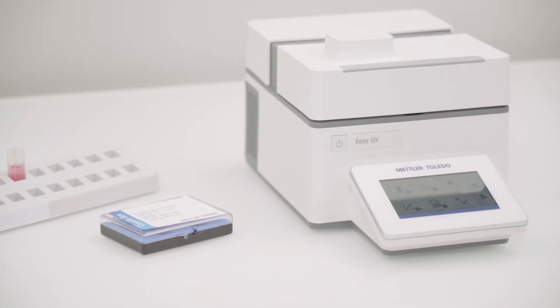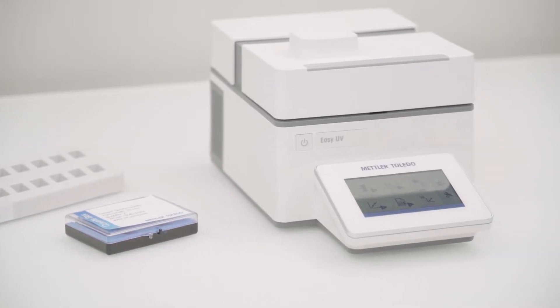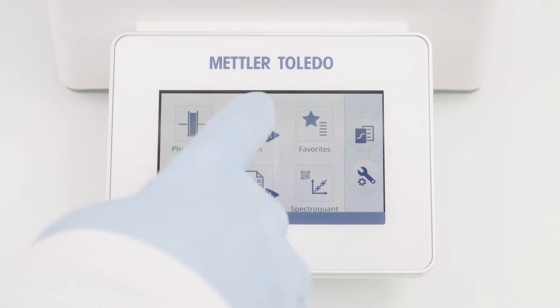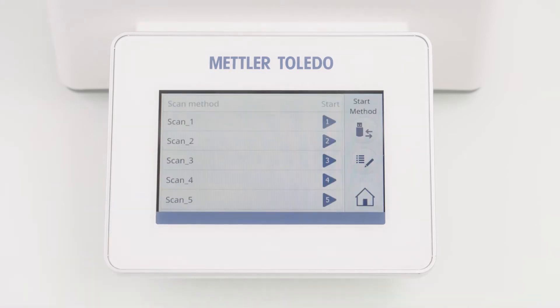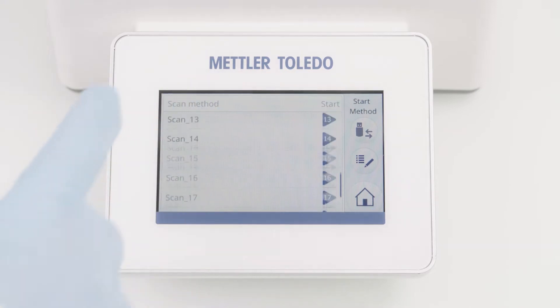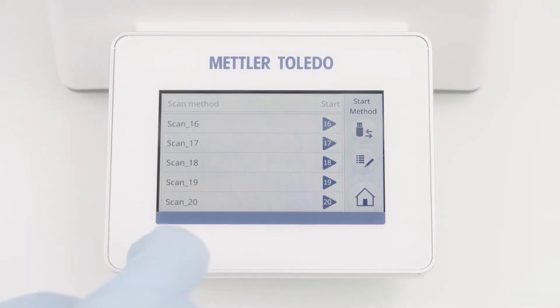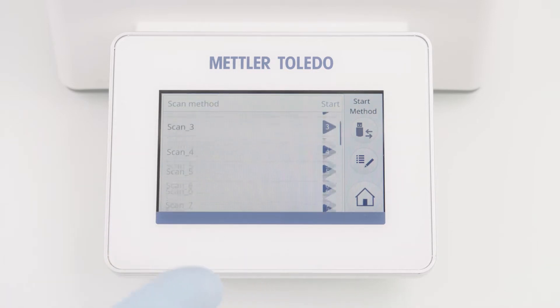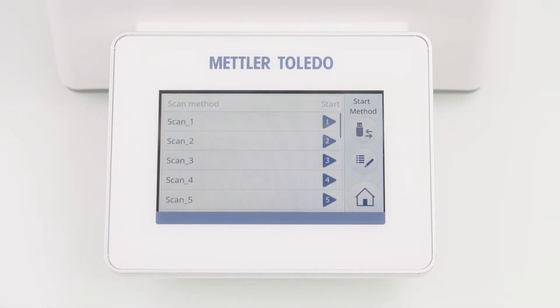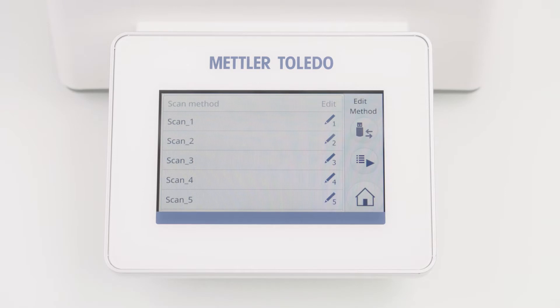Let's start with the configuration. Click Scan on the home screen. This opens a list of 20 predefined scan methods. Each method can be adjusted individually and exported to a USB flash drive. To enter the method editor, just click on the Edit button and select your method.